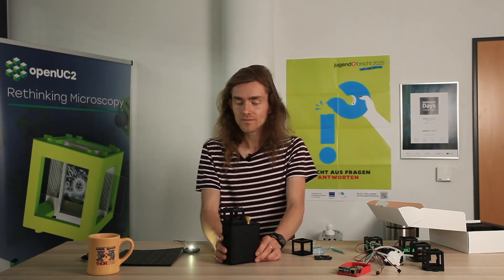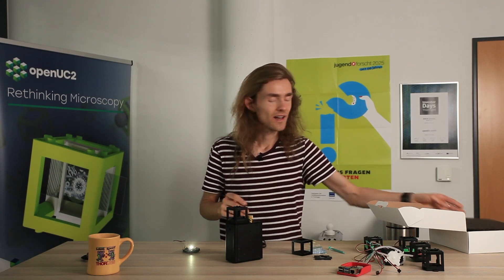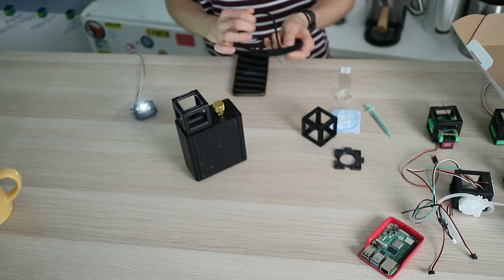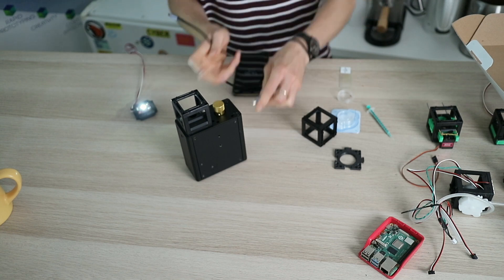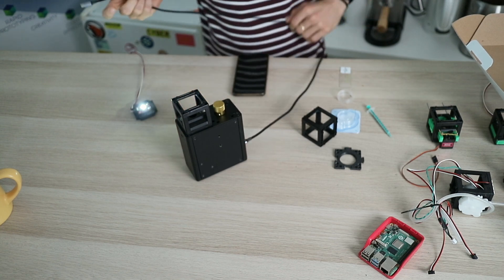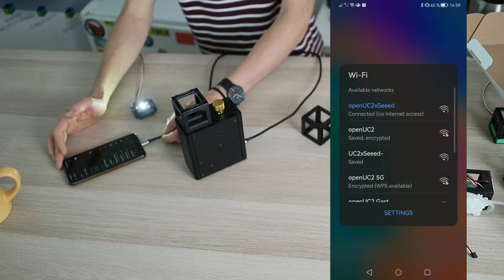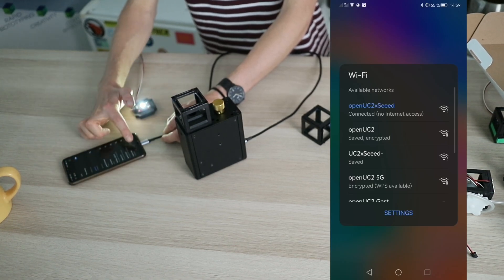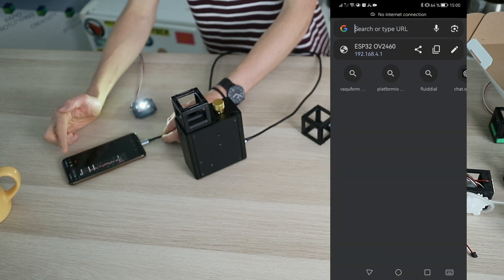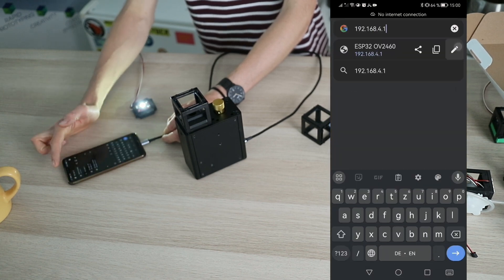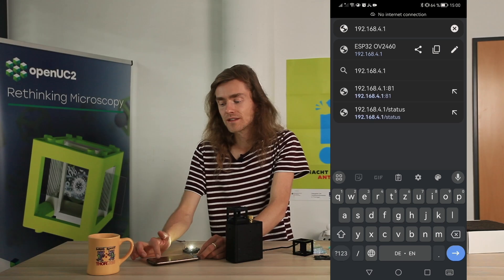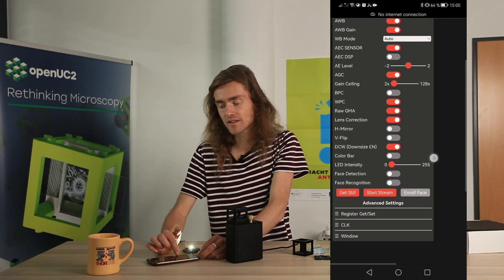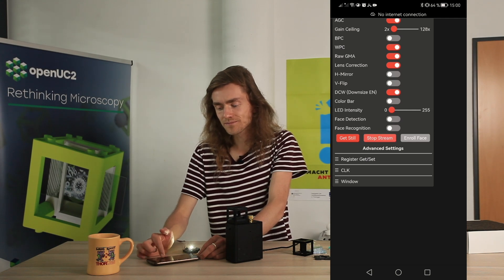For this you essentially just need to put the USB cable that was inside the box either into your USB charger or just your phone, and then connect your phone via Wi-Fi to the microscope. The Wi-Fi's name is OpenUC2x. You connect to that and then go to your browser and enter the URL which is the IP address of this little device, so I'm connecting to this machine now.